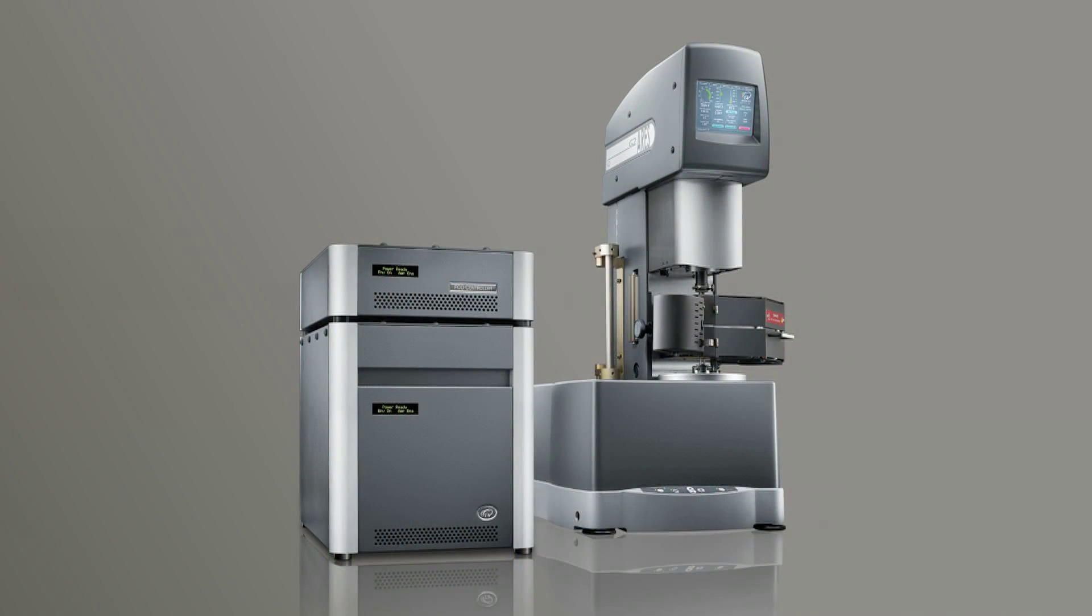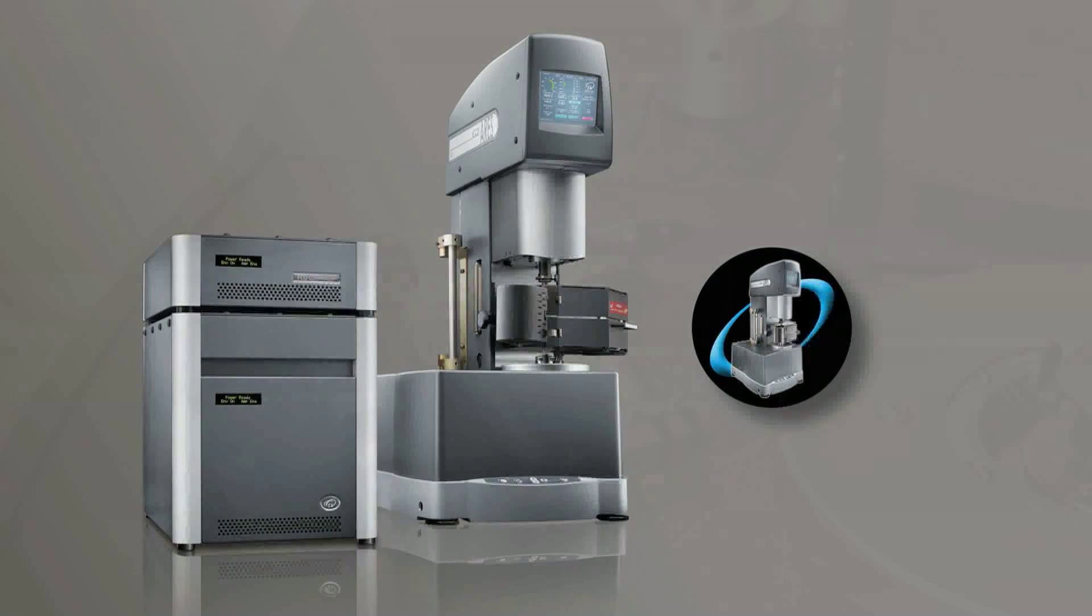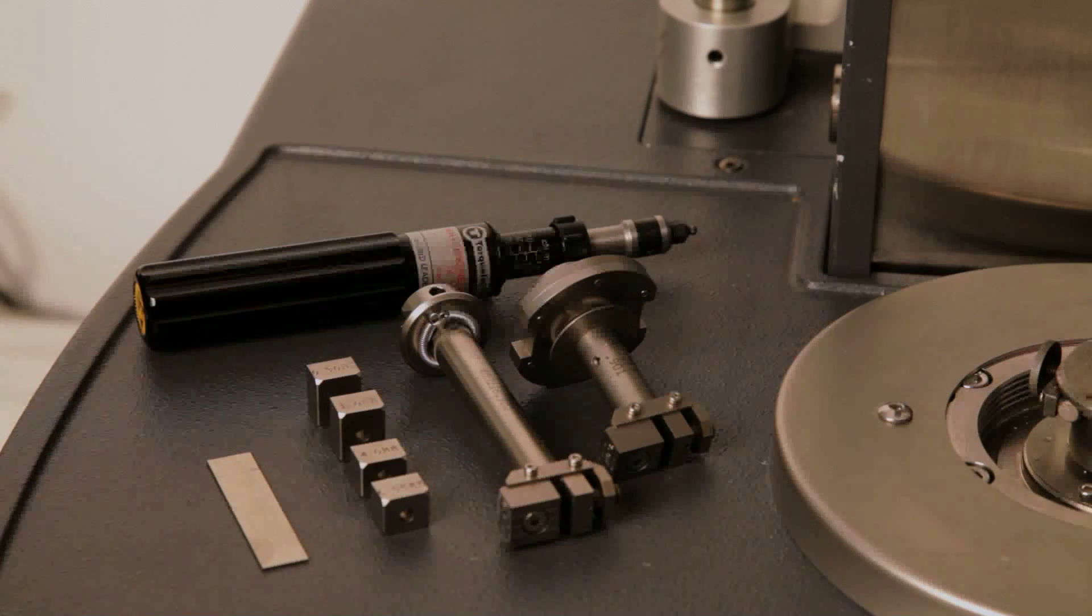First, ensure that the ARIES G2 with the force convection oven is fully enabled, communicating with the TRIO software, and you have a complete rectangular torsion kit.